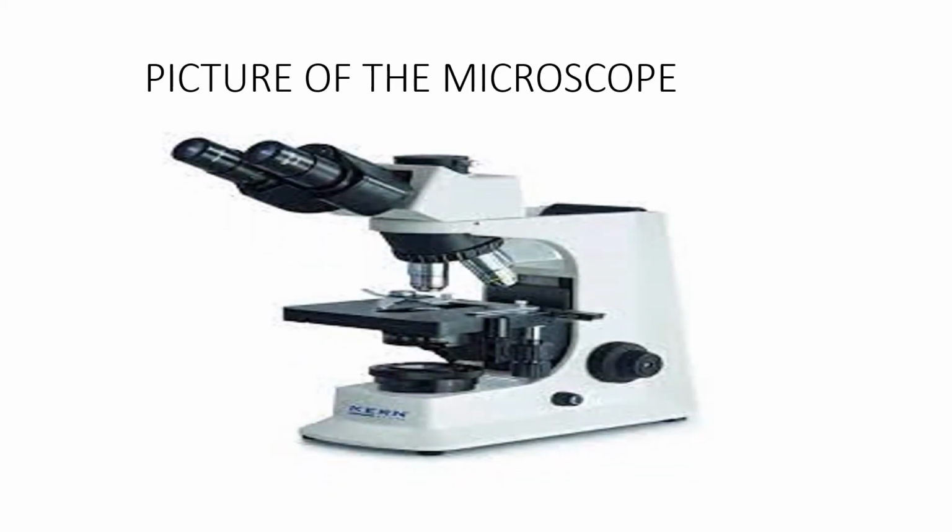Now let's look at the picture of a microscope. This is a microscope. So this is an instrument that is used to view tiny objects. We are going to discuss its parts later on, but as it is, it is what is used to view objects that cannot be seen with the use of the naked eye. There are so many things about it that helps an individual to view objects beyond the scope of the eye.